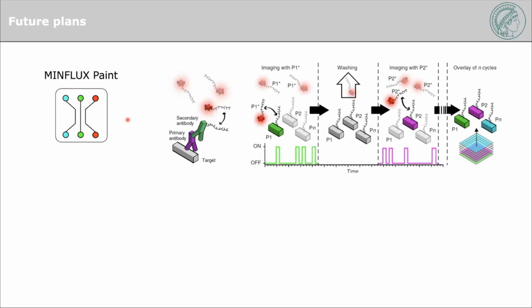This already works with this technology, but the experiment to do two-color experiments is basically 5 hours sitting there and then washing several times because we want to image several regions. This is something which would be really nice to be able to run overnight, also because these instruments are, because they are so slow in acquiring data, used basically all the time. So during the day, the time is full. So we try to use also the night time as much as possible so that we get data out of it. And they're also very expensive, unfortunately.